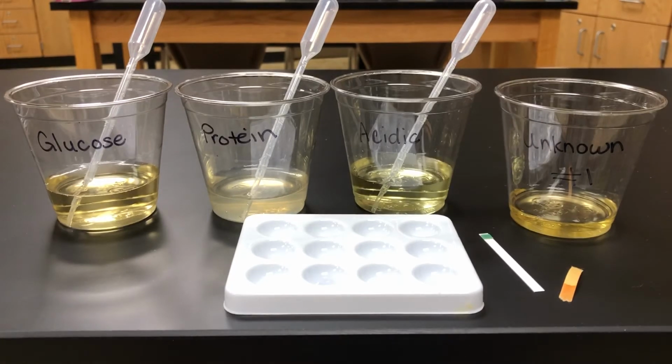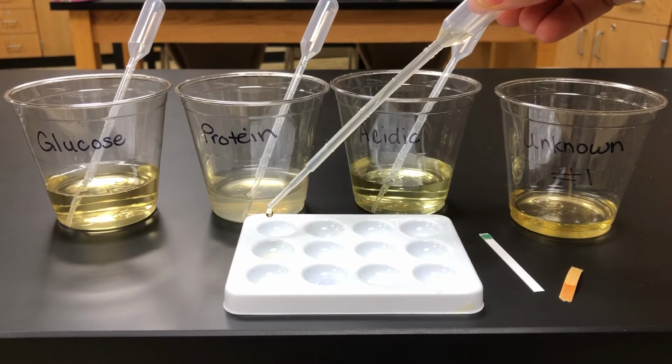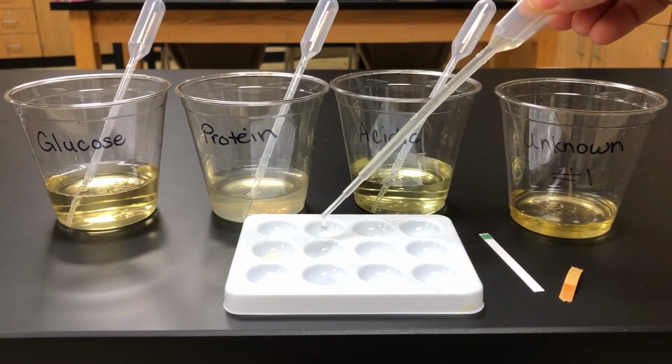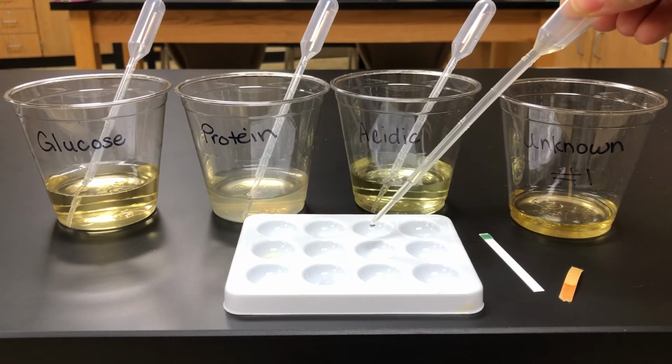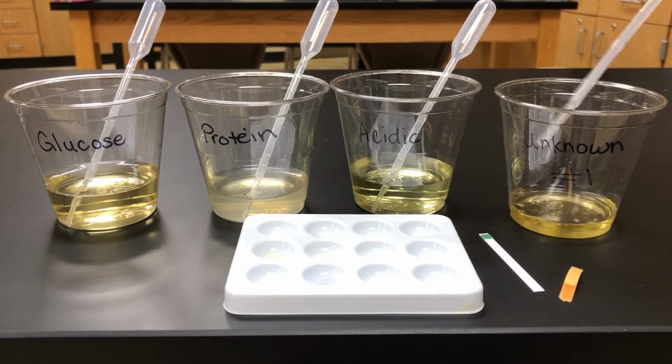So I'm going to grab a new pipette. Here is my unknown. We have unknown solution number 1. And we're going to put 5 drops in 3 different wells. There we go.